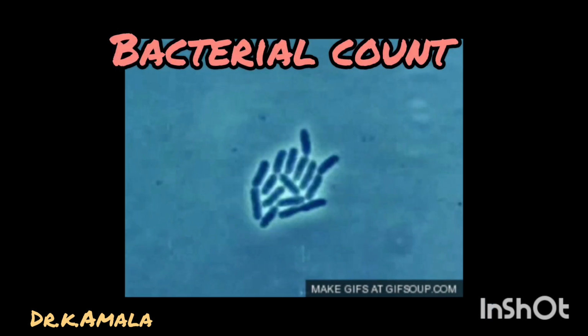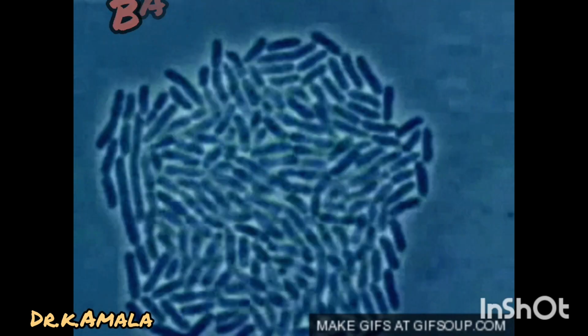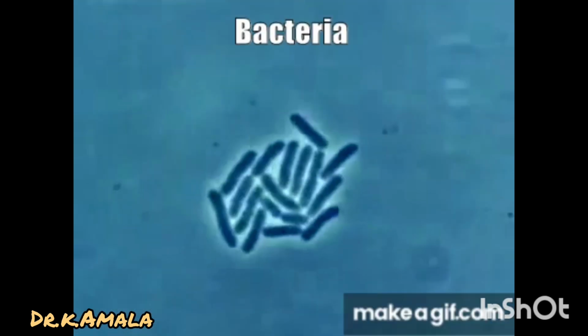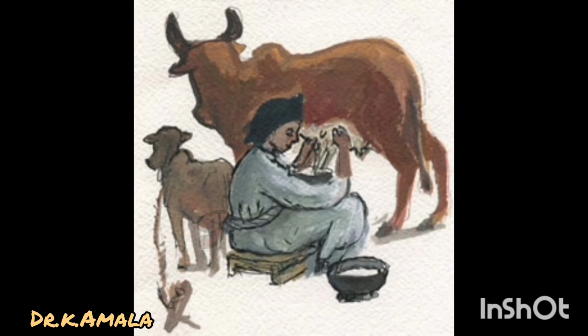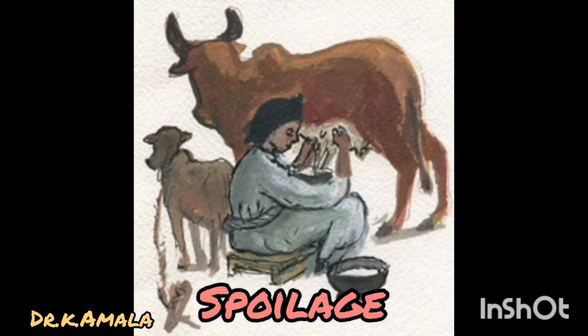The aim of MBRT: to determine the bacterial count in milk and the keeping quality and shelf life of milk, evaluate milk hygiene, and assess the milk's potential for spoilage.